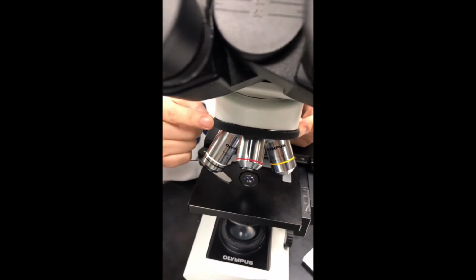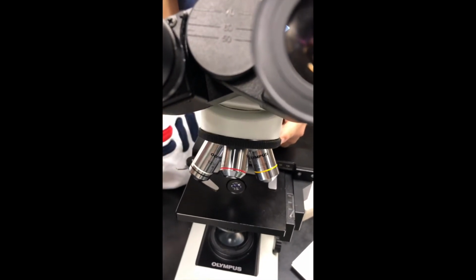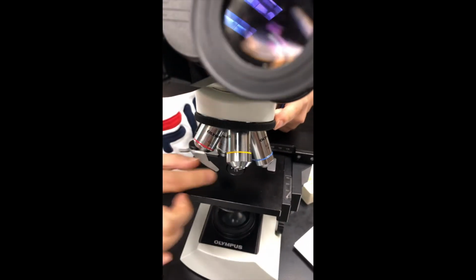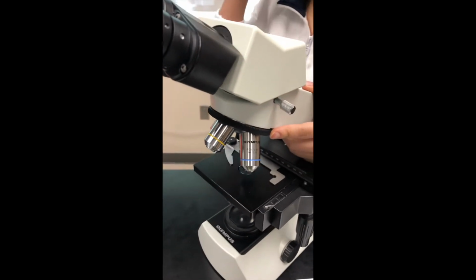The thing I want to introduce and to emphasize is that when you want to change to different objective lenses, you need to use the nose piece instead of holding the objective lens to change to a different objective lens. So this is something I want to emphasize to you.